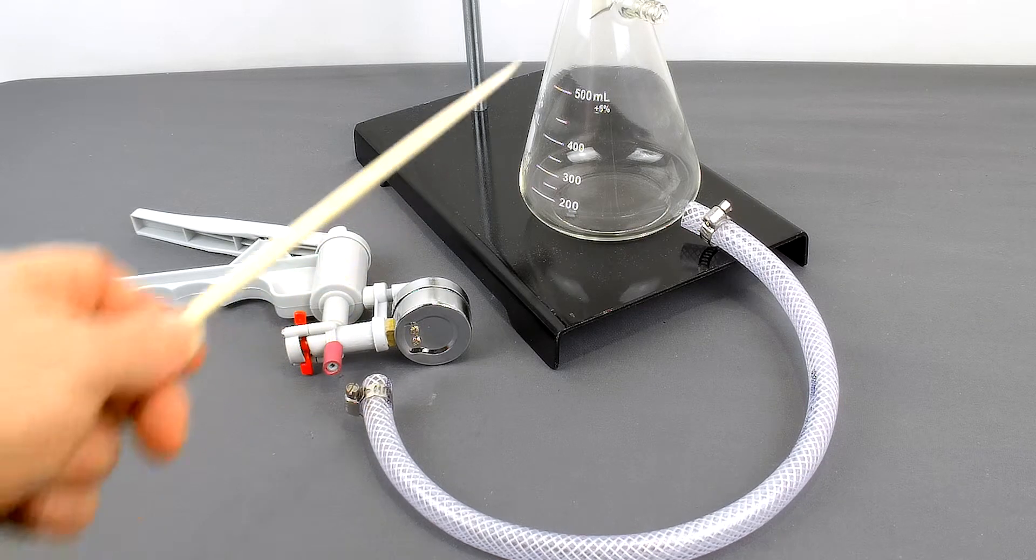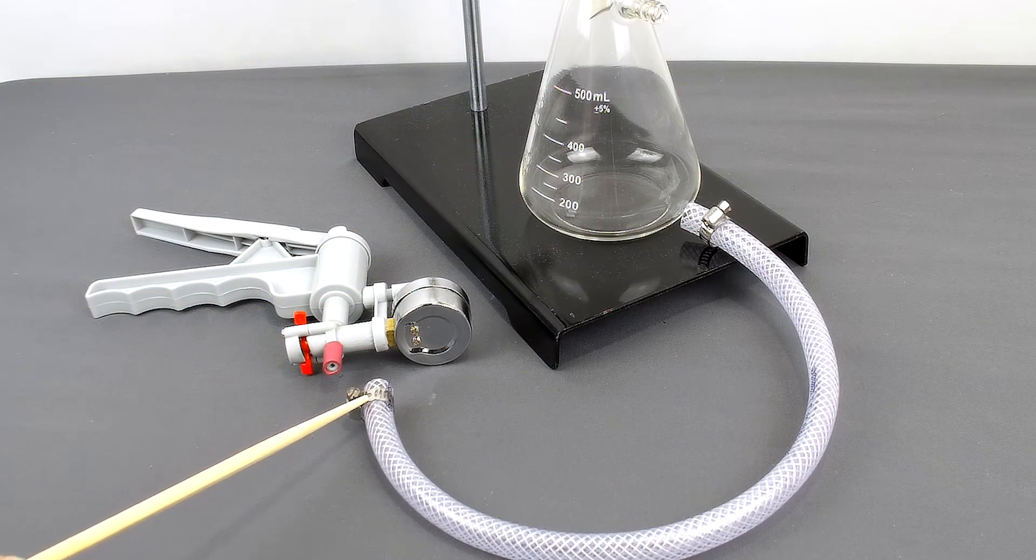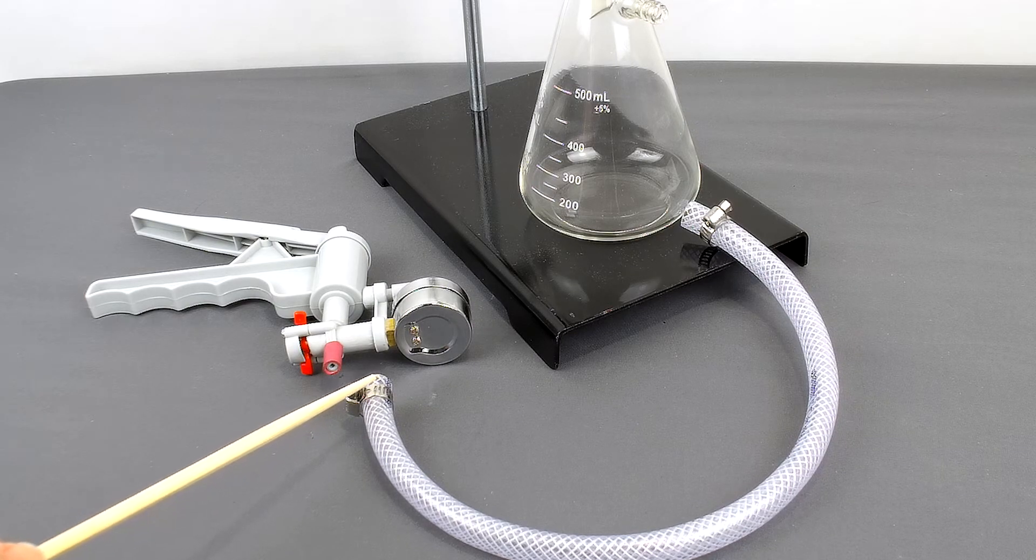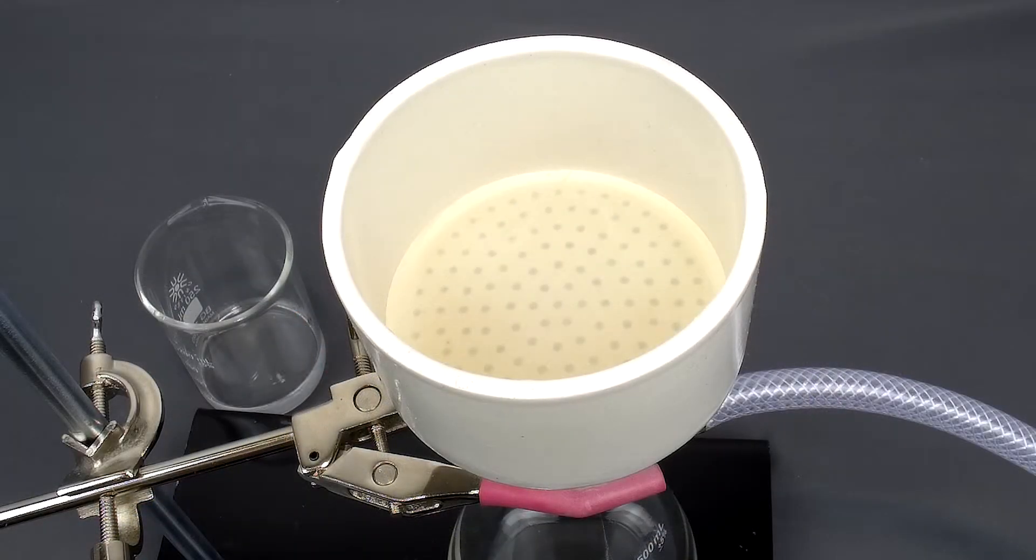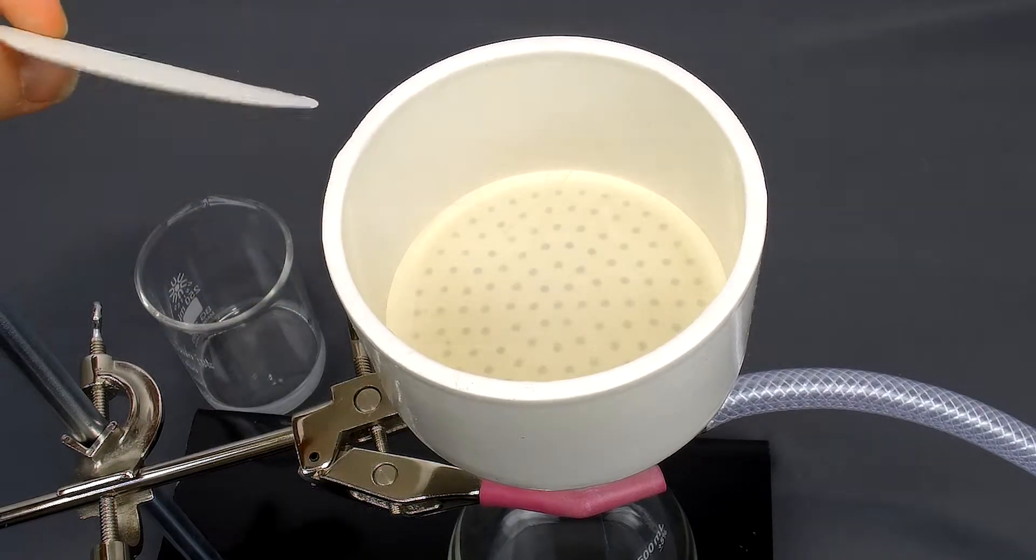The next thing you would do is connect the hose to the hand pump and to the flask. I would always recommend using radiator clamps to make sure that the connection is very snug.